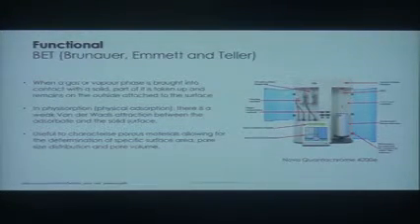Another technique, BET, named after its founders. So BET, what you should think about with this technique, pretty simple. You want to measure the surface area of your material, okay? And it doesn't give you some kind of absolute surface area. It's a surface area relative to the adsorption of a species onto the surface.